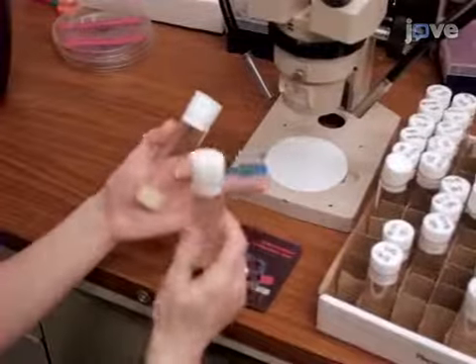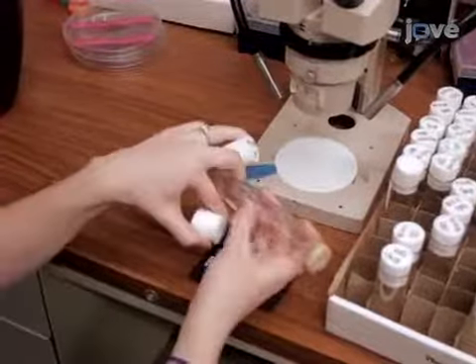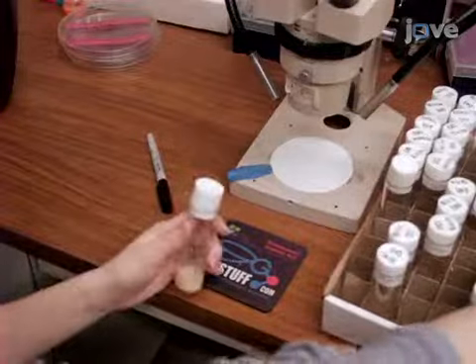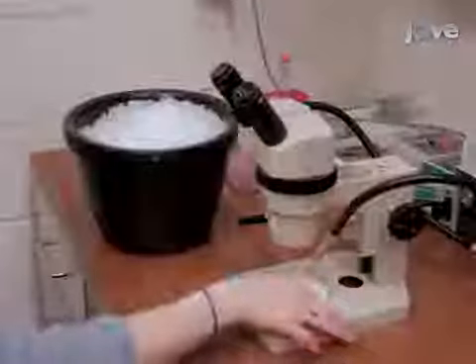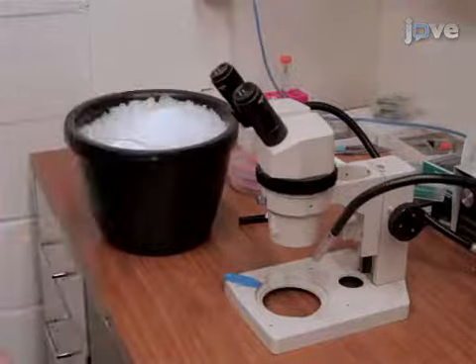In this procedure, collect the newly eclosed flies from the well-maintained fly cultures, then age them 5 to 10 days in fresh culture vials before recording. Before the fly preparation, chill the microscope plate on ice for 15 to 30 minutes.